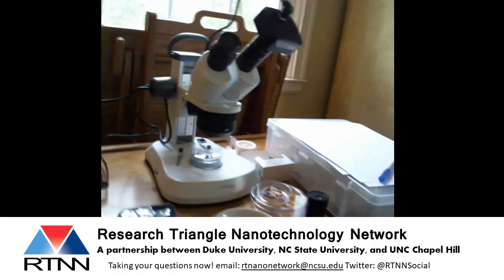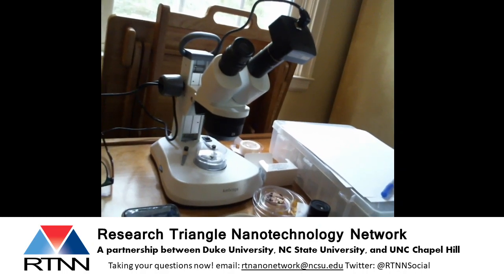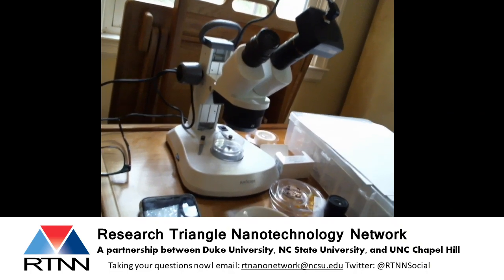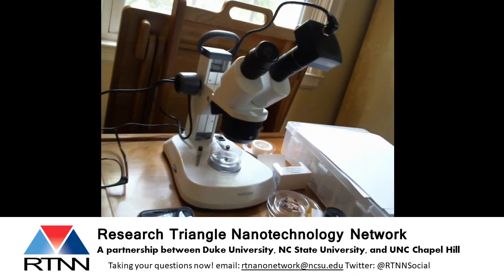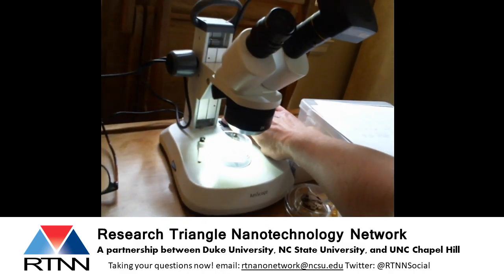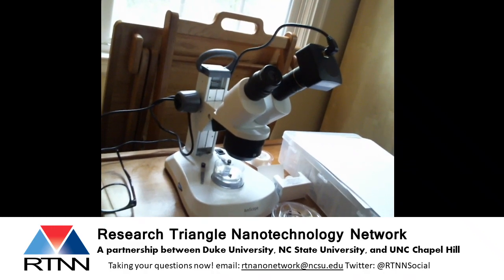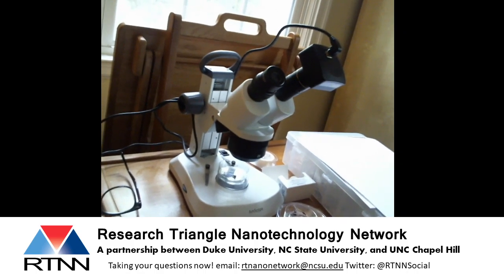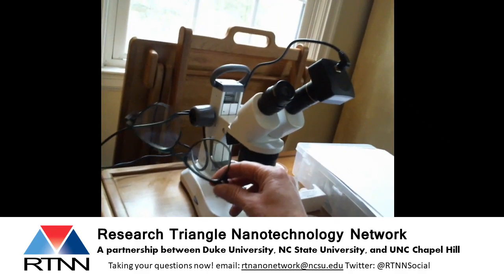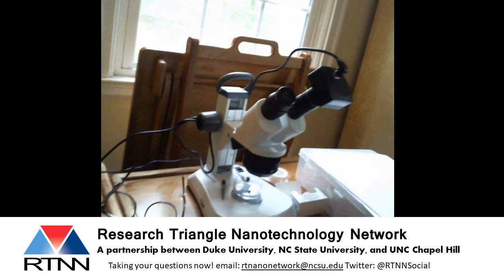And this microscope, normally you would put your eyes right here, but I've got a video camera here so I can show you what we're seeing through this microscope. And again, this is a light microscope. So a light microscope is going to use light to make an image. So I'll turn on the light here. You can see the light. Oh, that makes it very bright. It's also going to use glass lenses to take that image and make it look bigger to let us see those tiny details. And those glass lenses are kind of just like the lenses you might find in your eyeglasses that can make things look a little bit bigger, or in a magnifying glass.